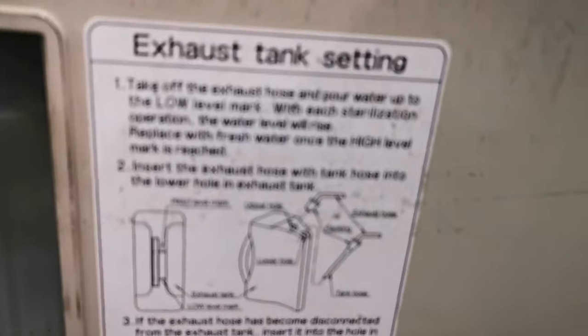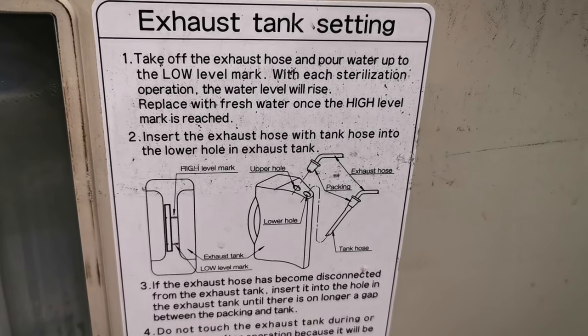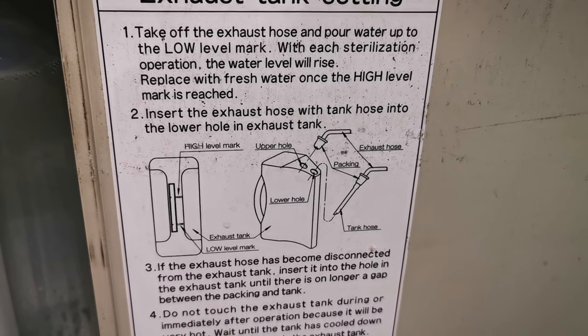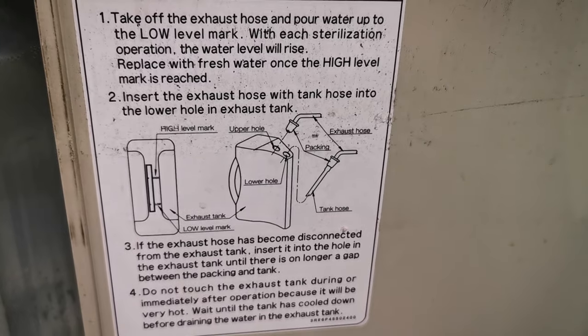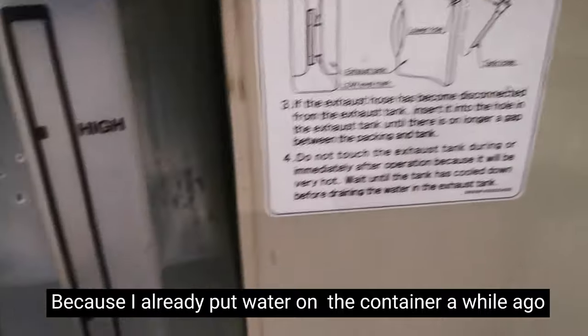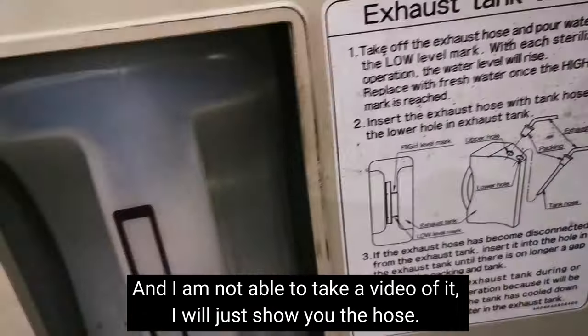Let's read the instructions. Number one: take off the exhaust hose and pour water up to the low level mark. With each sterilization operation the water level will rise; replace with fresh water once the high level mark is reached. Since I already added water earlier and didn't get to video it, I'll just show what the hose looks like.